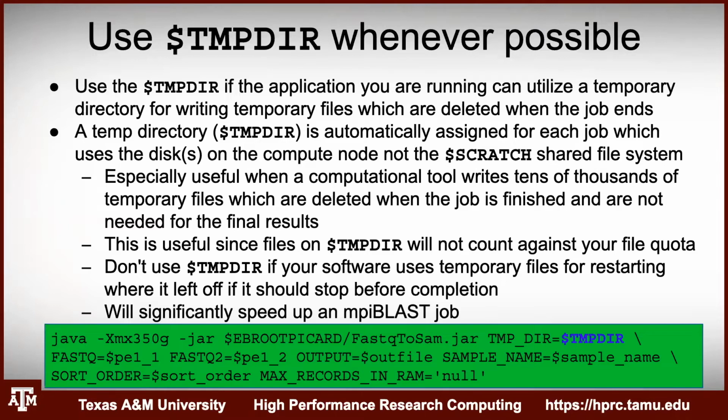Trinity is going to generate thousands and thousands of intermediate files that it'll delete at the end of the assembly process. Similarly, if you're going to annotate a genome and you use Maker, it produces a lot of files. And you do have a file limit quota on your Grace account. So if you do one of these things, you may actually exceed your file limit and it'll cause an issue with the program.